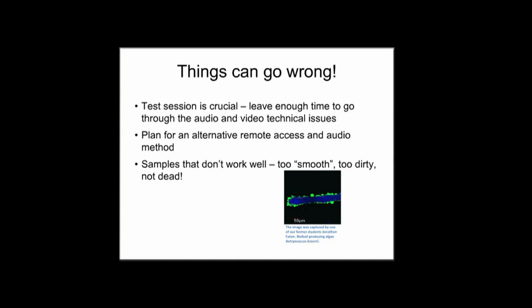And we haven't had anyone send in live samples, but I have had people using our lab give us live samples. So we would appreciate that your samples are dead before you mail them off or send them off, because they do need to be dead, and we would prefer not to have to kill them for you. And then this is an image also I wanted to point out.